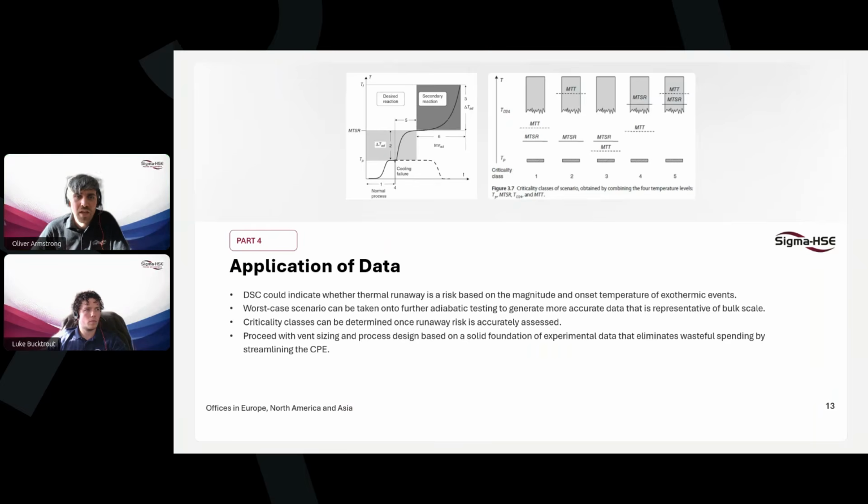When exothermic enthalpy and material specific heat capacity is characterized accurately, this can be used to really efficiently calculate the adiabatic temperature rise that a system will experience, for example, in a loss of cooling scenario, and thus the potential then for a decomposition reaction to be triggered that may have been seen and evidenced in those thermal stability DSC early stage scans.